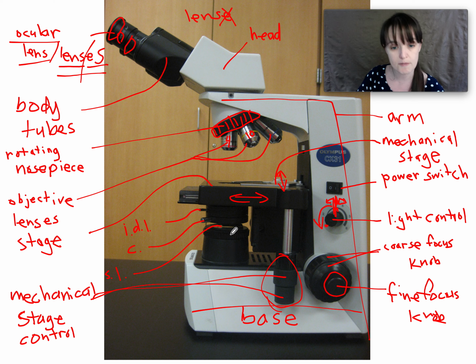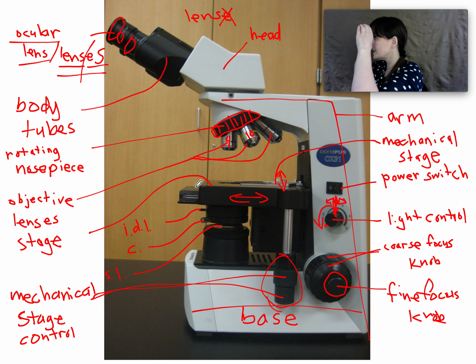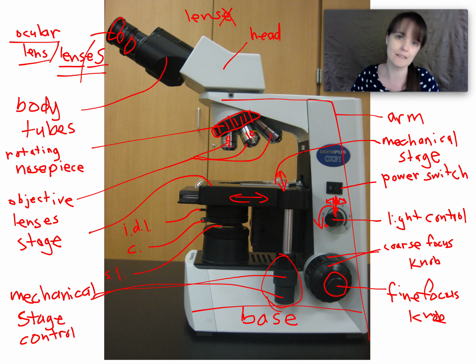Because of course, if the light is coming up here and what you're seeing it through is right here, if your specimen's way up here or way down here, you're not going to see it, right? Like, where's the screen? Well, you got to look at the screen, so line it up. So line your specimen up in the visual axis, but we'll do that next semester.